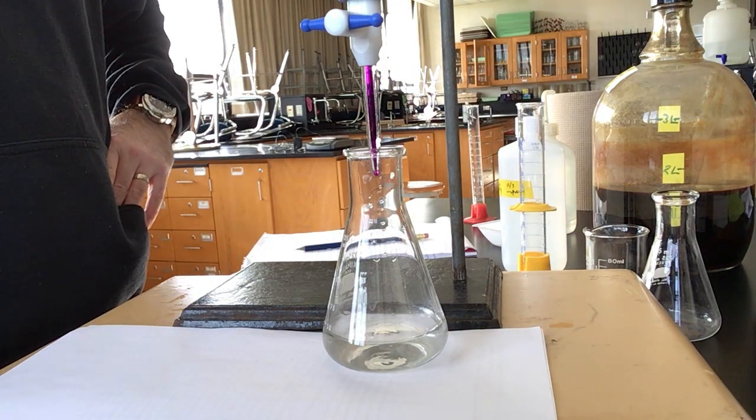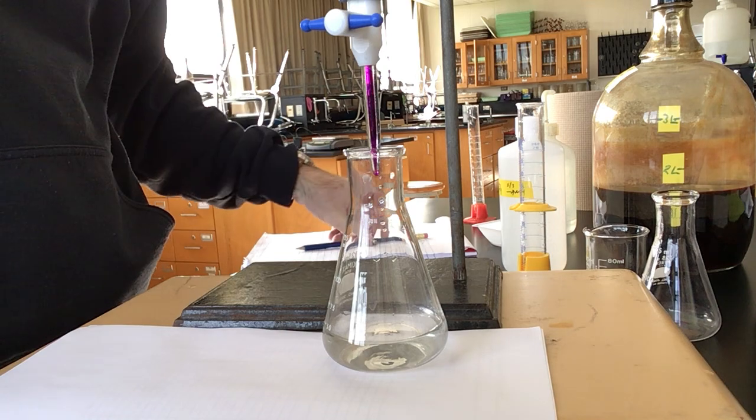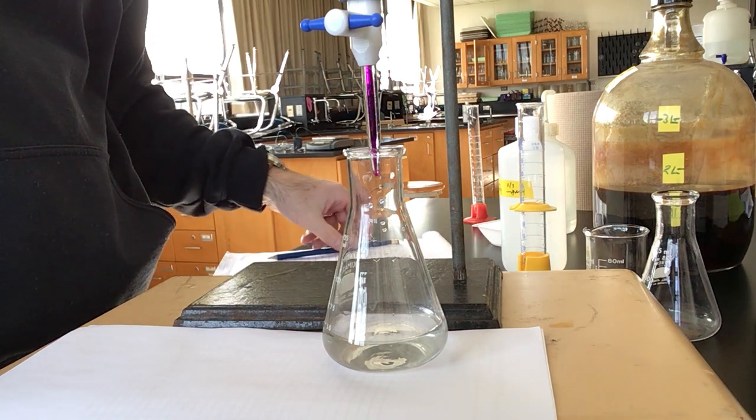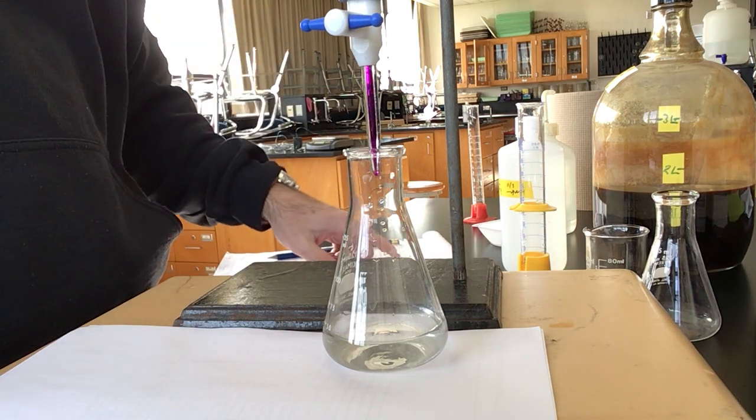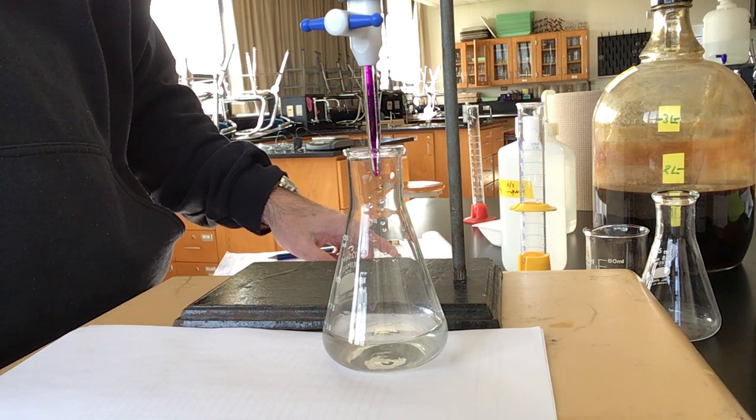Alright everybody, so I've got everything positioned. I took my initial volume of my titrant, the potassium permanganate solution, as 25.30.